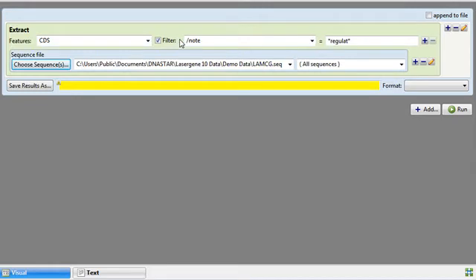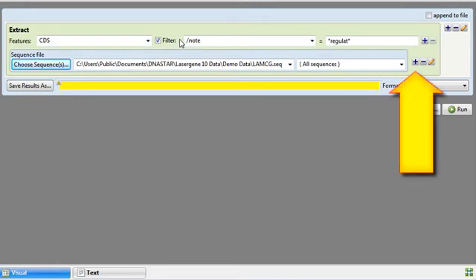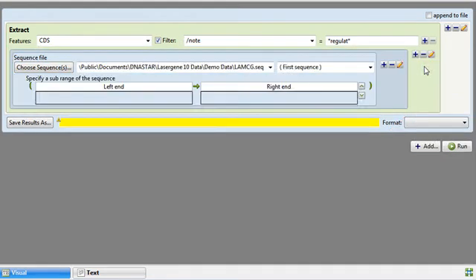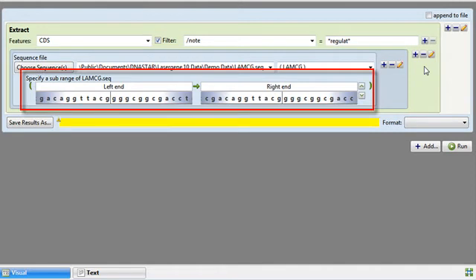I only want to search a subrange of this sequence, so I'll click the plus sign to the right of the sequence file area and choose Add Subrange. Next I'll type in the left and right coordinates into the corresponding range boxes.